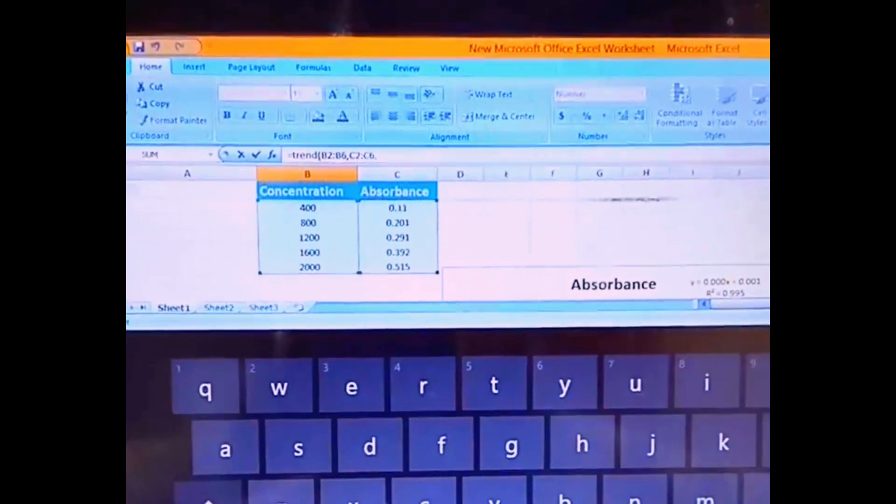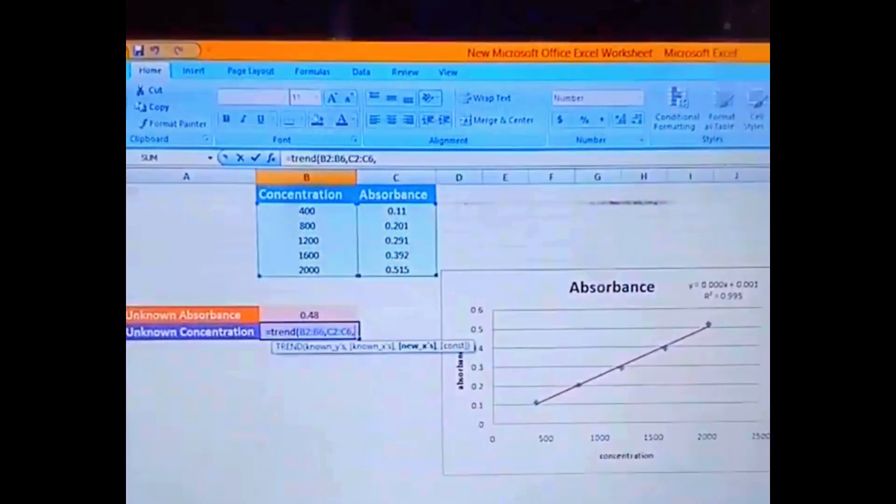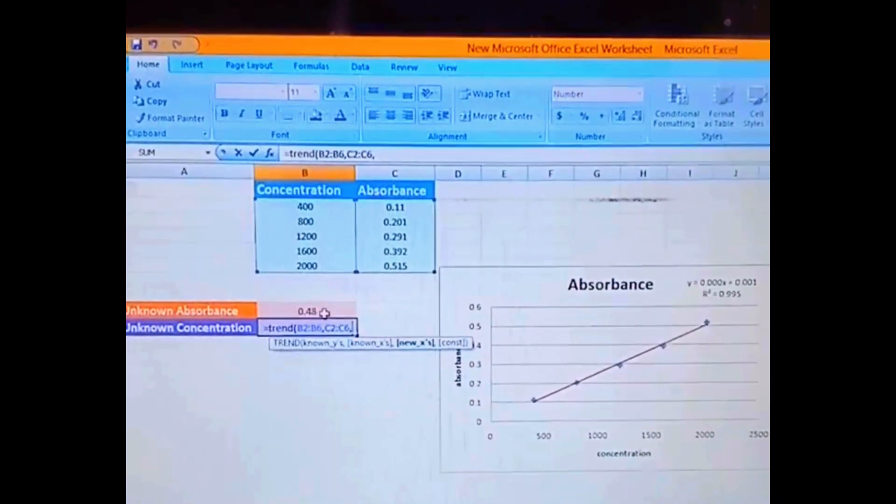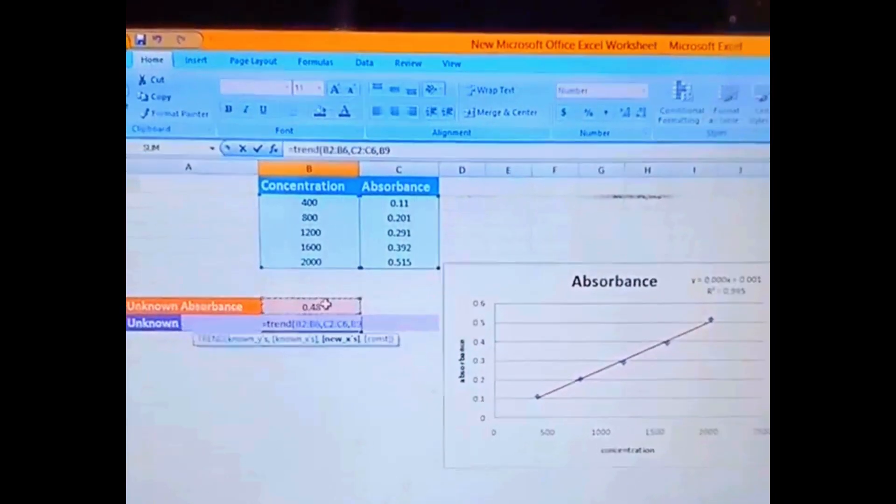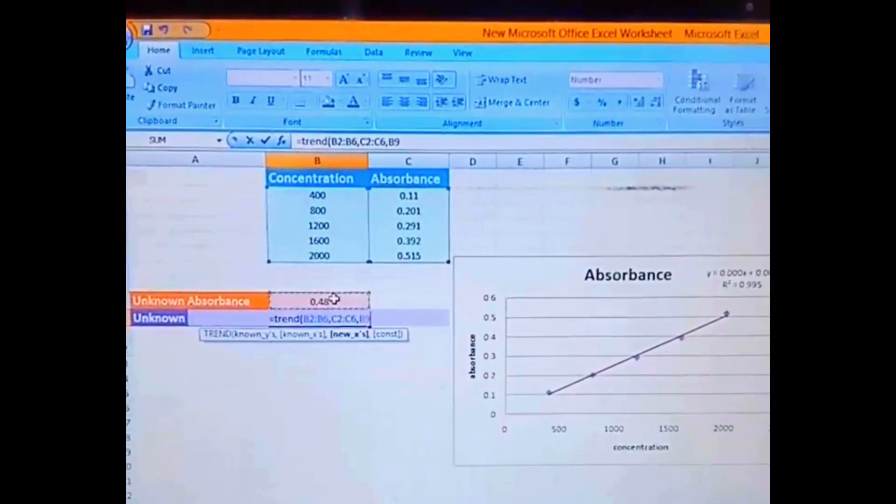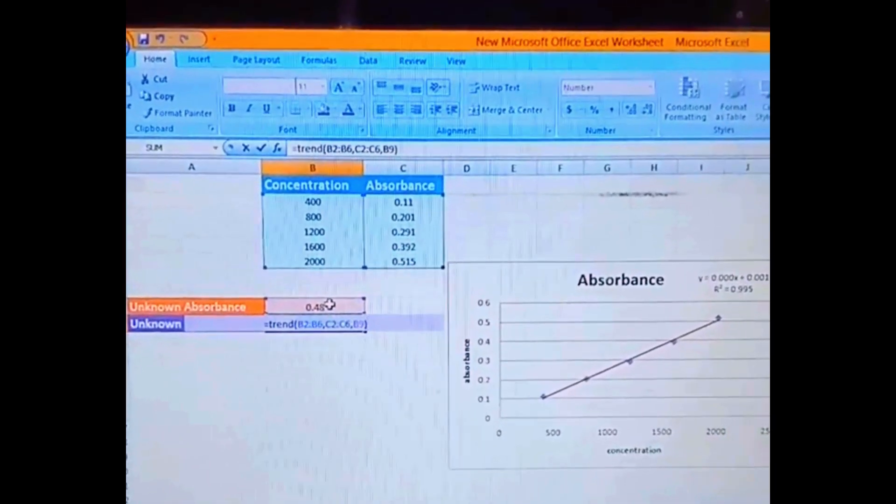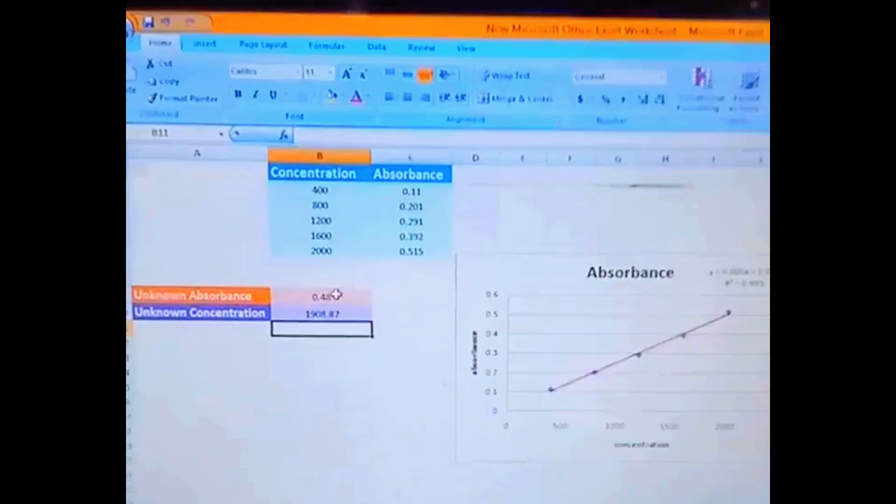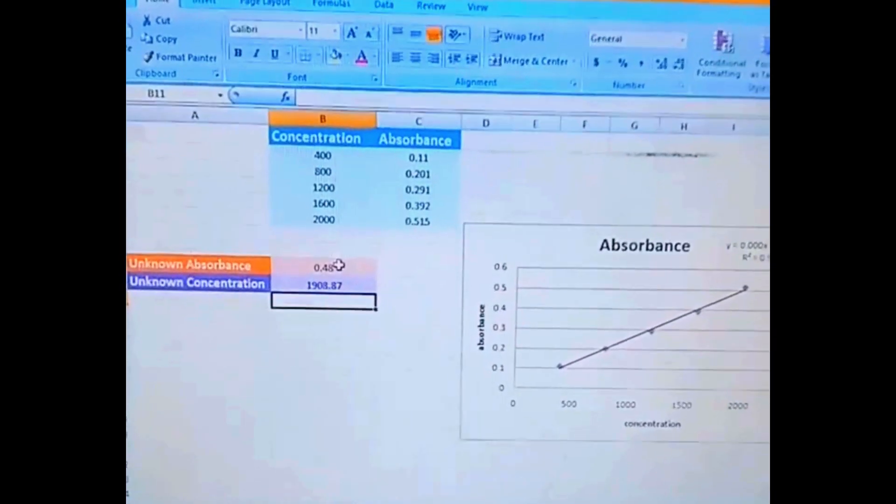Now again I am putting here the comma, which is the essential part, otherwise you will not get your answer. And now we have to select this unknown absorbance value. Now we have to close our parenthesis and enter it, and here is the value of the unknown concentration.